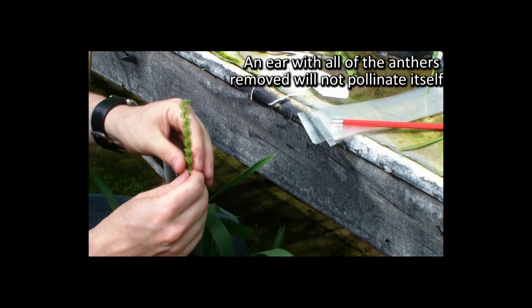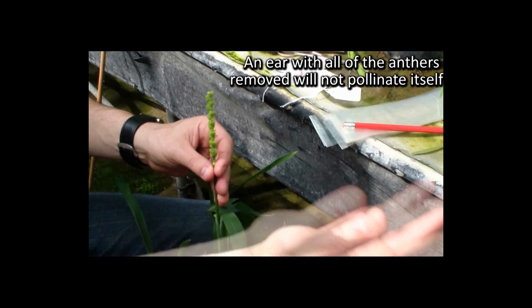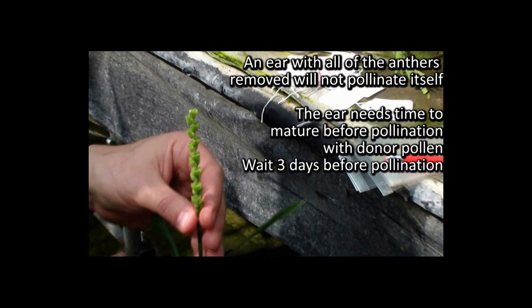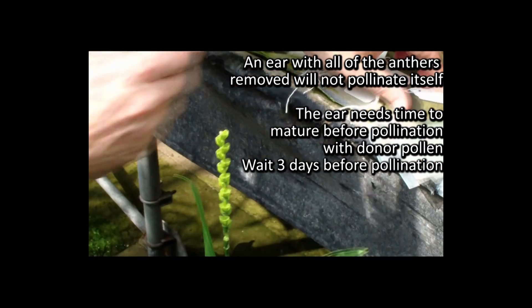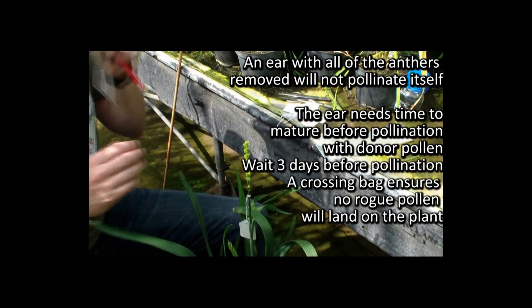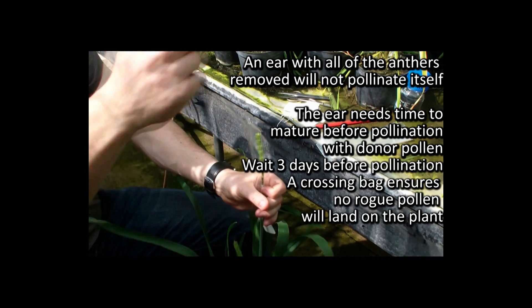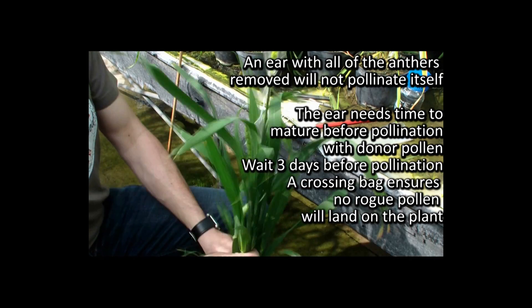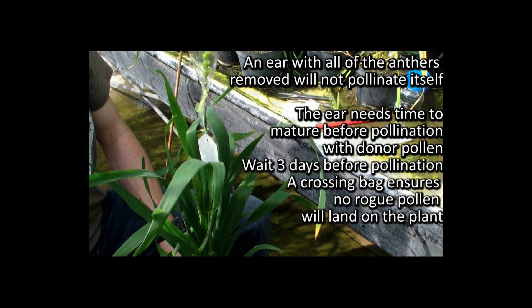Now we have an ear that's completely had all its anthers removed so it's not going to pollinate itself at all, and we're going to look for bringing in some donor pollen from another plant. It takes a while for the ear to mature to the correct stage for pollination to occur — for this one probably about three days. Until that point we'll label the plant with some identification and get a crossing bag popped on. This will ensure that no rogue pollen comes in in the meantime. We'll tie that in and come back to it in three days time looking for pollen that we want to introduce to this plant.